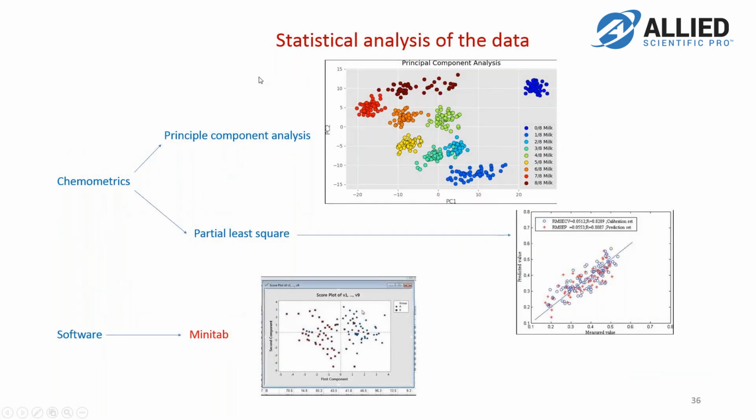So this is almost the last slide. I'm going to finish very soon. The spectrum that you measure when you are using the Near IR method is more complex than the mid IR, because it could be a combination band you're looking at. It could be a harmonic. So if you have many different materials in your sample, they could basically give you confusing results.